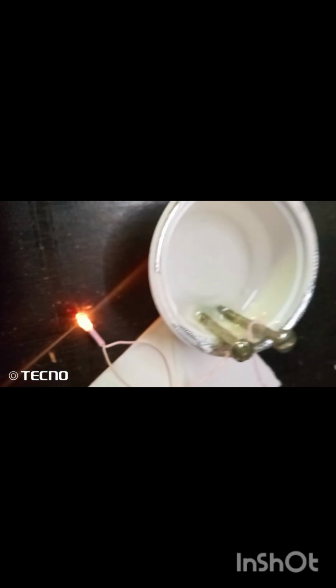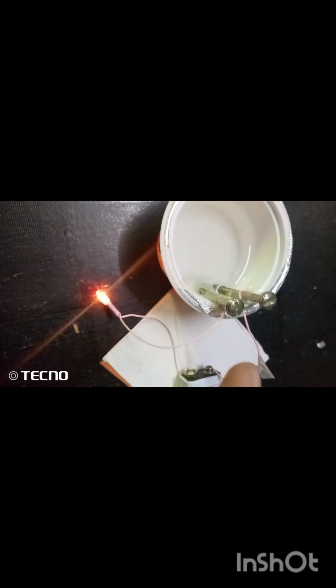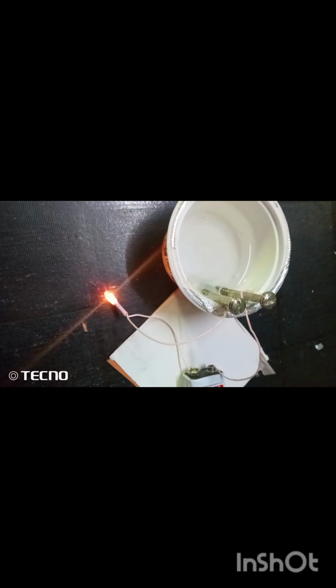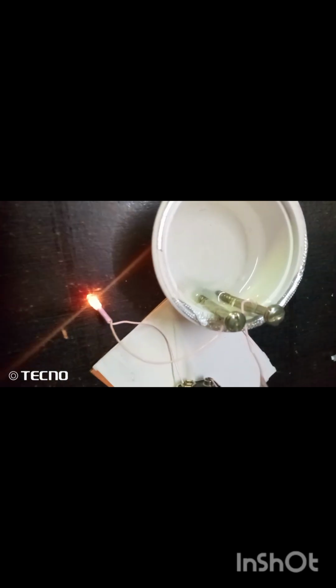Even you will be able to see deposition of metal on the cathode if you take two different metals. You can also hear some sounds. I will try to let you hear the sound also. I don't know whether you have heard or not, but I am able to hear the sound. And here bubbles are formed.